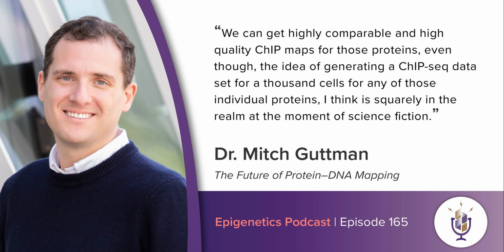You can imagine that if you're doing a single chip and you happen to pick an antibody that doesn't work or doesn't work well, the worst case scenario is your experiment doesn't work. But if you're doing a pool of, let's say, 100 different antibodies and you happen to pick one that doesn't work well, will a bad antibody spoil the pot? And that is a unique challenge for thinking about ChIP-dip or multiplex methods in general, an additional challenge beyond just the traditional antibody limitations.